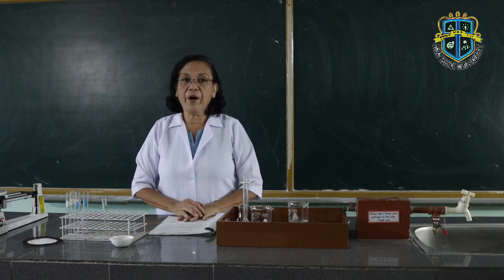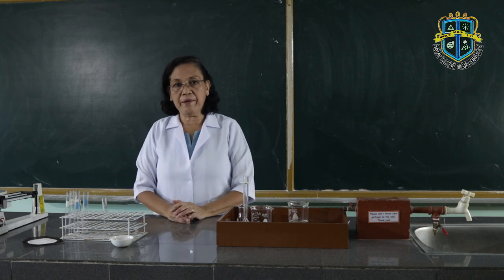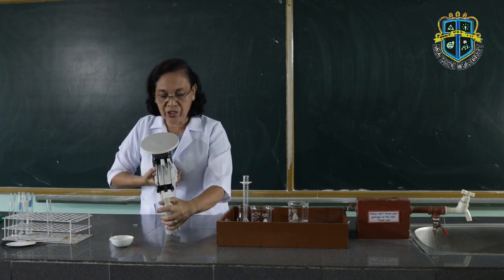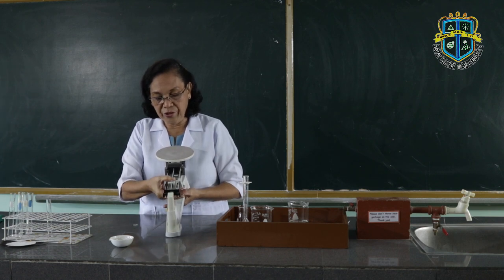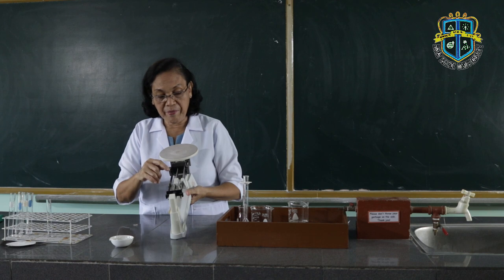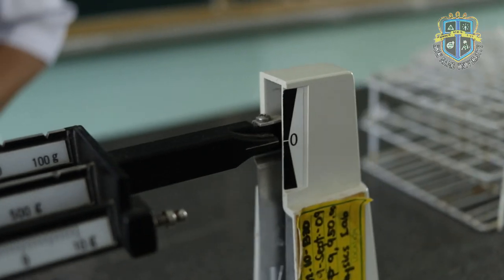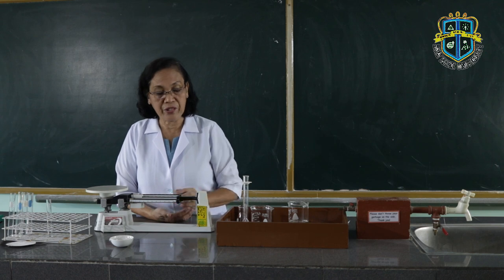In this procedure, we are going to measure the mass of the table salt, and because we are going to measure the mass, we are going to use a triple beam balance. If you look at the construction of the triple beam balance, there are three beams on which the riders are placed to determine the specific weight or mass of the substance — that's why it is called a triple beam balance. Before you use it, you have to see to it that the pointer points to the zero mark, so you have to adjust all the riders and the pan should be cleaned.